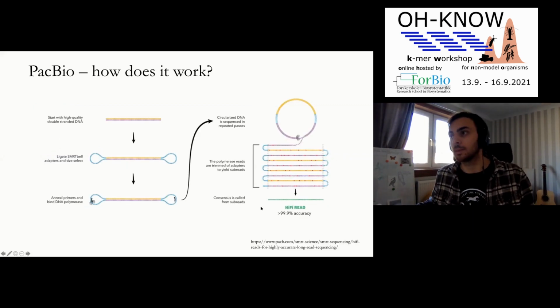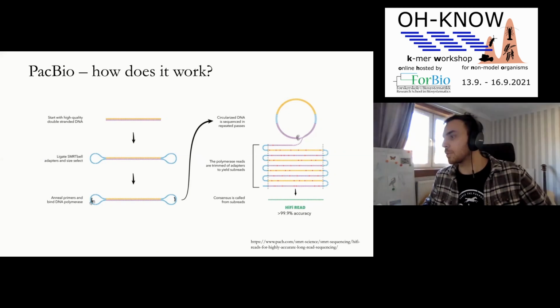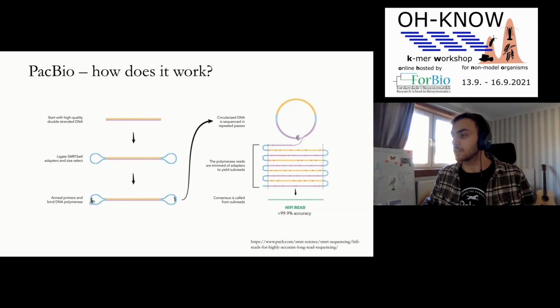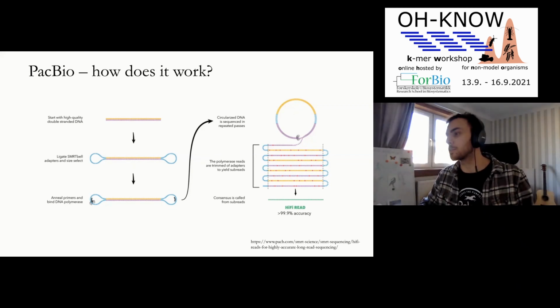Some of you are working with Pacbio data. Pacbio machines are also evolving quite rapidly, and there's new ones coming out, it seems, every year or so. Right here is an example of Pacbio's latest technology, the Hi-Fi system. If you don't work with Pacbio data, some of you might still think that Pacbio data is very error prone. But the reality is Pacbio have generated this new Hi-Fi system, which is pretty remarkable and has similar accuracy to Illumina reads. So that trade-off that you used to have of length over sequence quality is getting smaller and smaller.